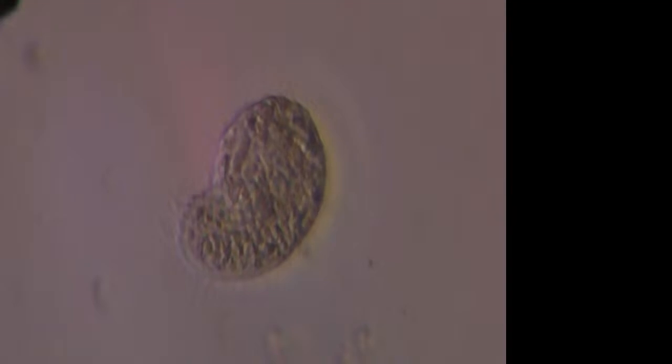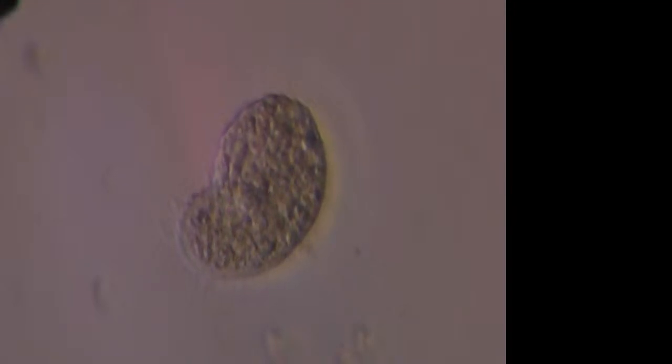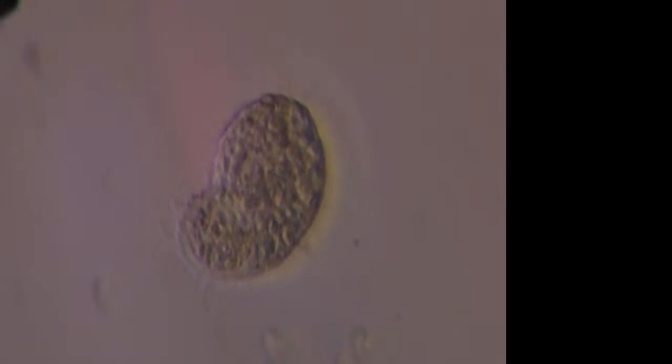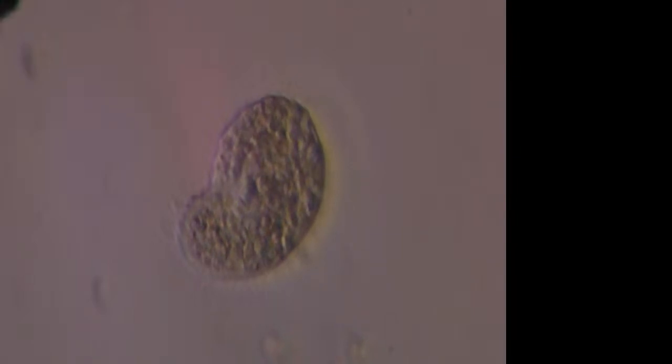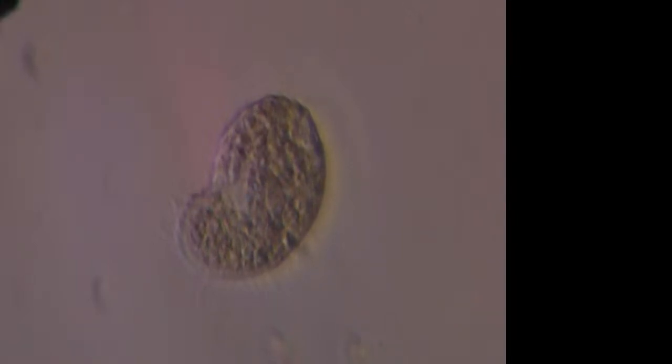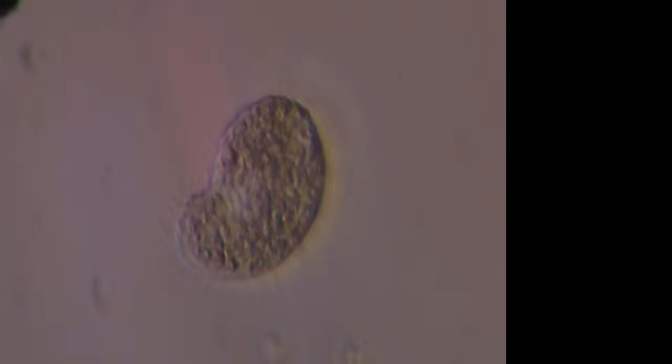This thing is still going. I thought it was going to break apart based on the behavior, but it might just be taking a break from swimming for a while. The cell looks very healthy still, so you can see all the content streaming around like normal. I thought for a moment it looked like it broke a piece off, but it could have been some background debris.